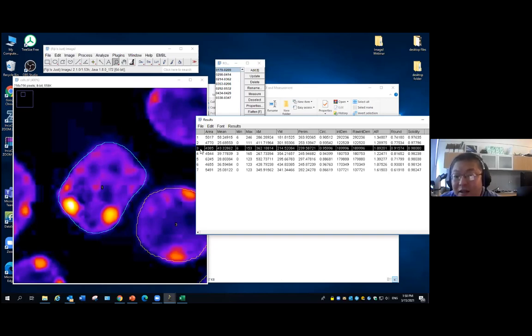In another sense, if you think about it, this doesn't actually affect how you do the analysis on the image. Once you have a digital image, all the analysis is done based on the pixel unit. The program only knows it as a pixel. They work on the pixel.